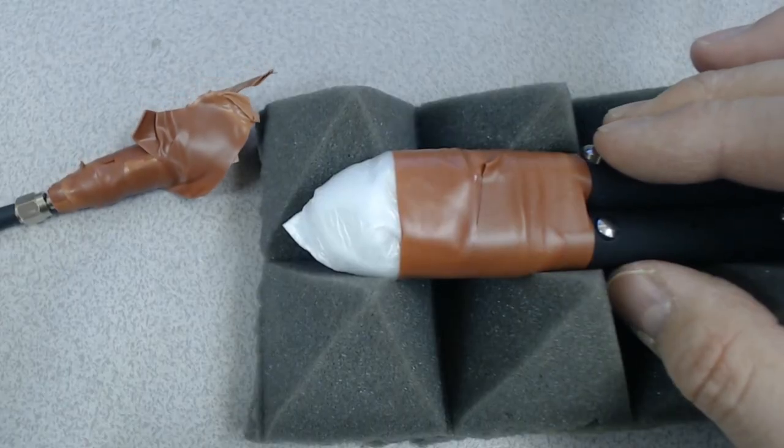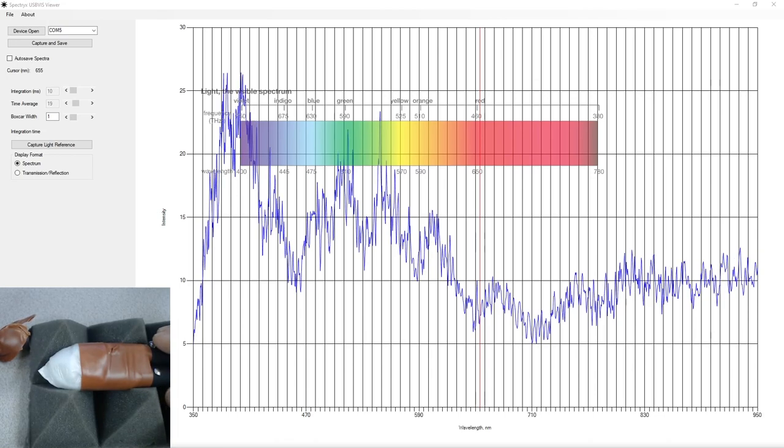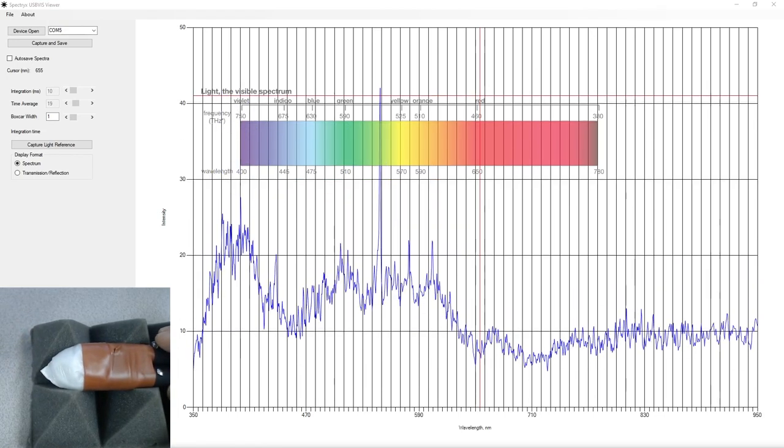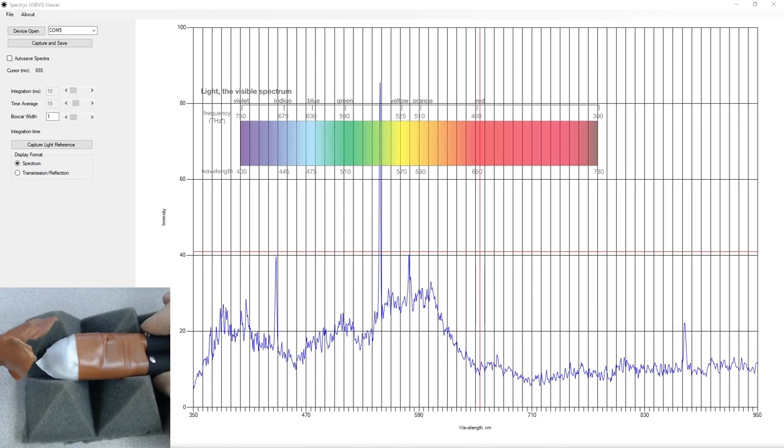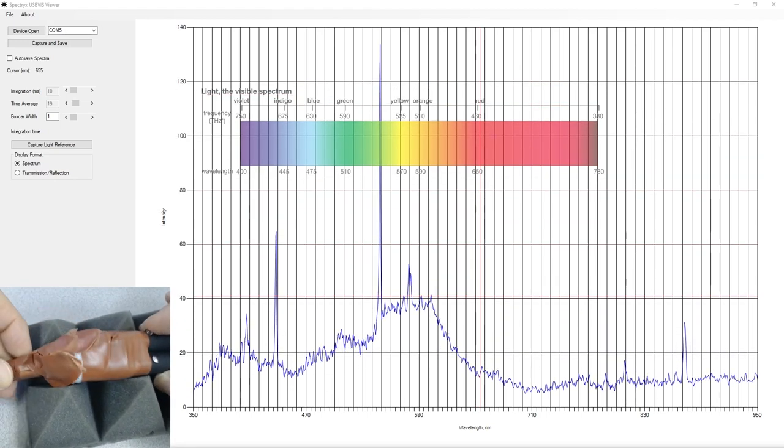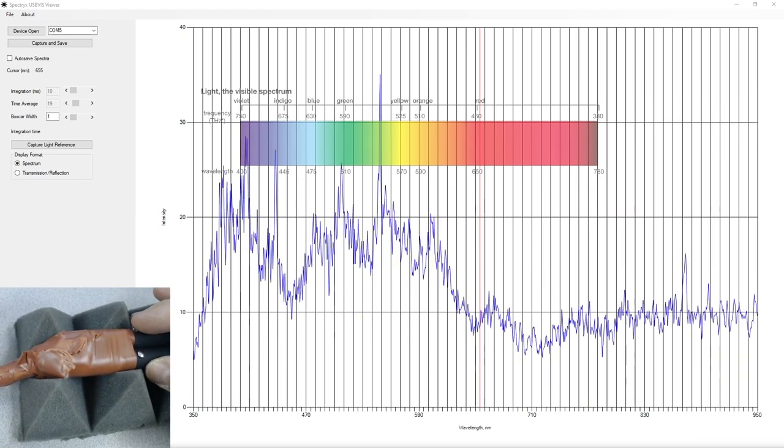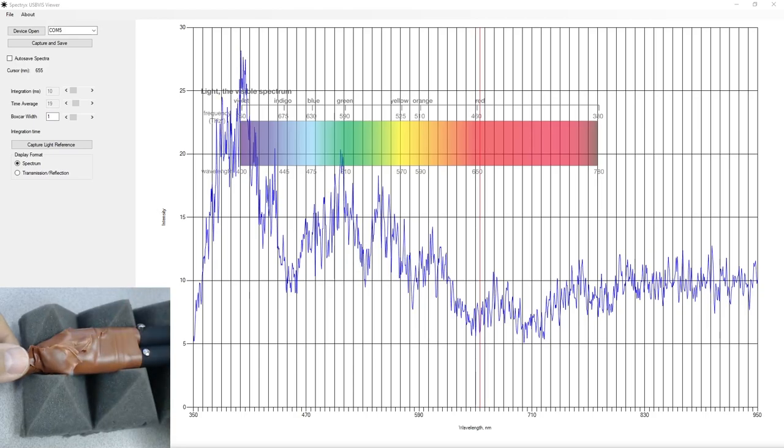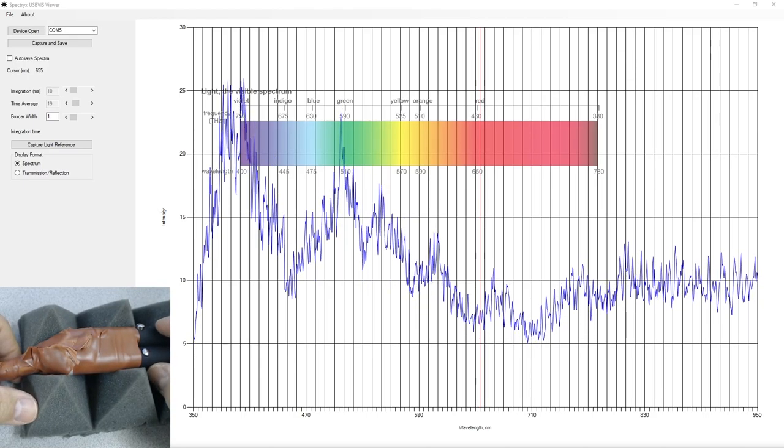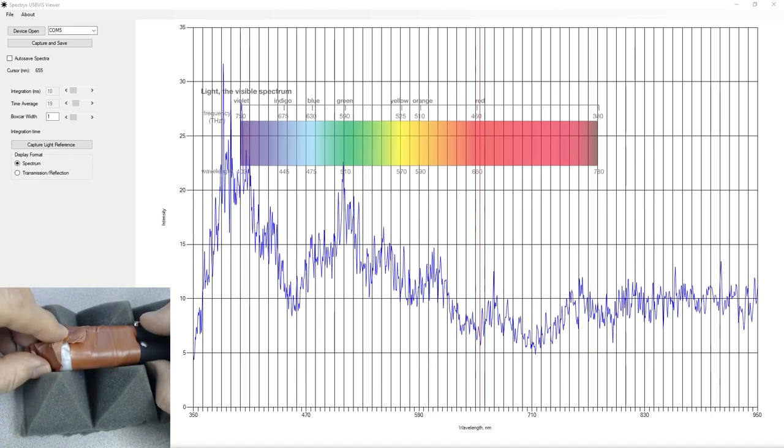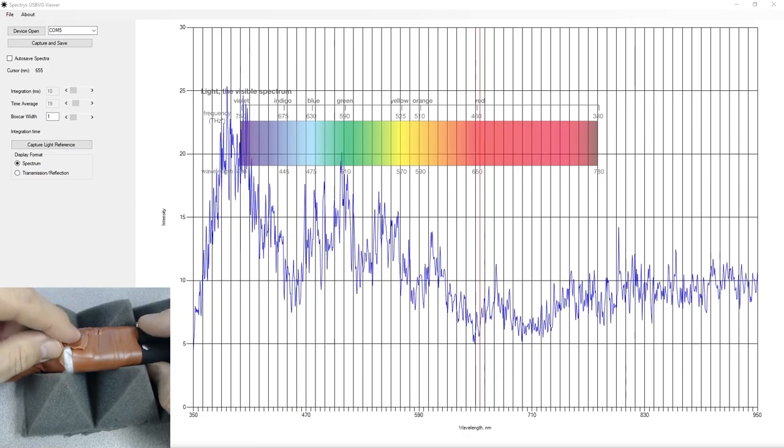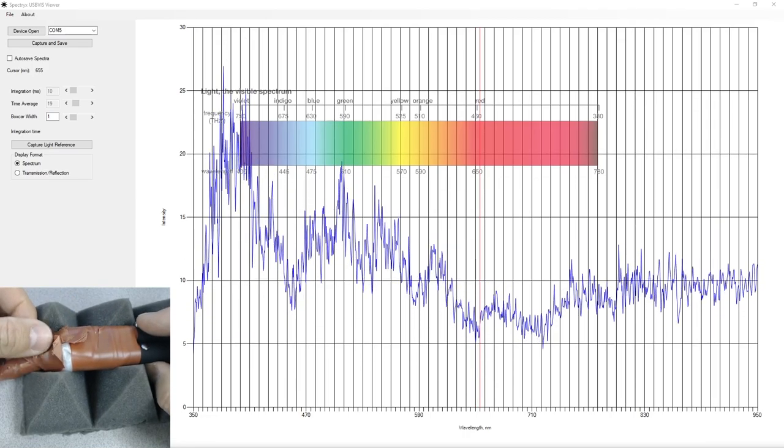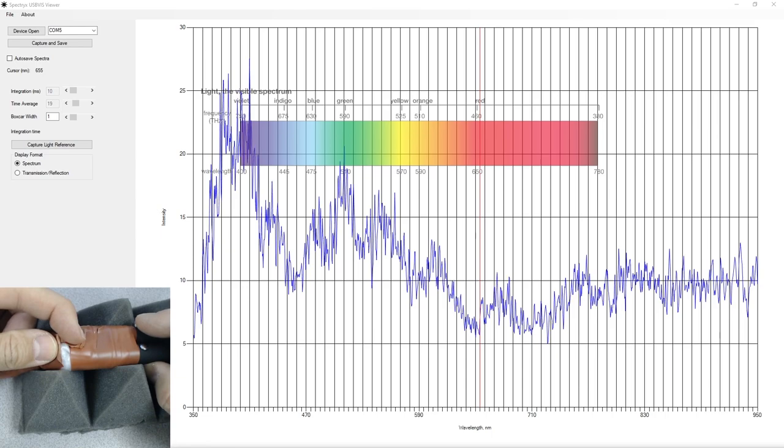And so what I'm going to do is I'm going to switch off the overview camera and you can see the spectra here. And I'm going to place this on here so that it's kind of looking into the hole. And just like that. And you'll see that essentially there's noise in the background there. In fact, if I go like this, I can actually see the color of the LED here. But you won't be able to, unfortunately, on this webcam because it's just not very good at seeing coherent light.